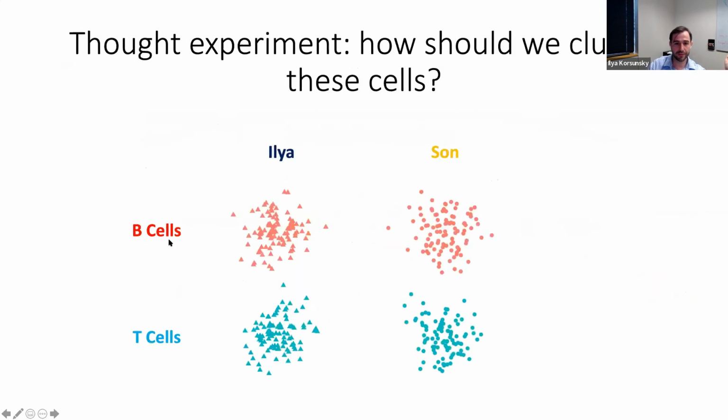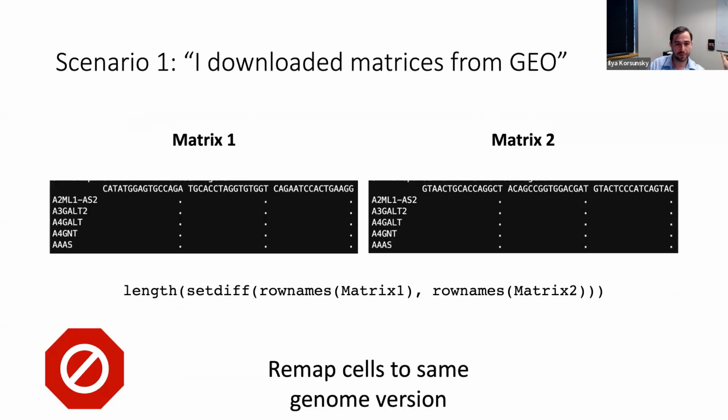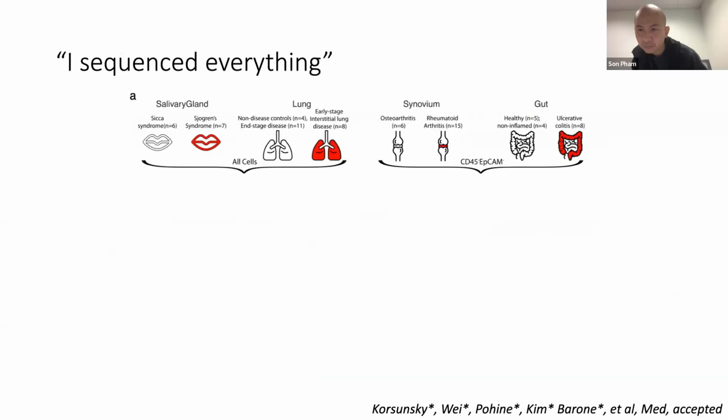It's actually on bioRxiv and it'll be in Med soon, the paper that we did with the multiple tissues. We had 70,000 fibroblasts from synovium and 1,000 from lung. So we really had to deal with this issue. We ended up using weighted PCA, and that solved like 99% of our problems. So yeah, definitely very important. You can downsample. I don't like downsampling because we're throwing away data, but you can use weighting strategies to give both data sets equal weight.